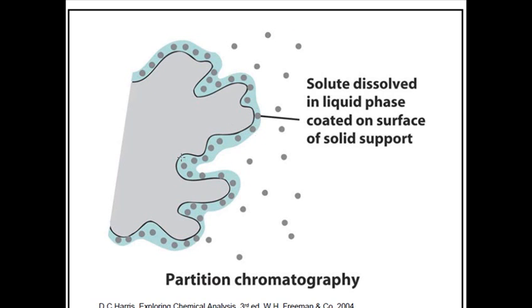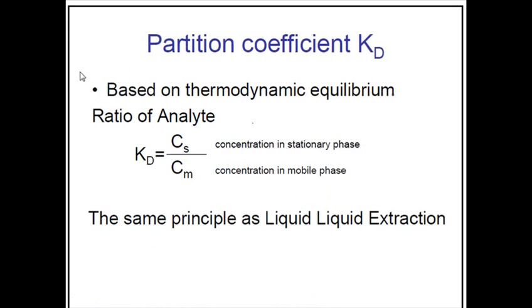In the second one, we are doing the partitioning chromatography. In this case, it is based on solubility. So what is this solubility? Here, some solutes dissolve in this coat which is around the stationary phase, and some dissolve less in this and more in the mobile phase. Some molecules which dissolve greater in this stationary phase coating will stay there, so they elute last, and some which do not dissolve in this coating of stationary phase elute faster. By making this partitioning using solubility, we can separate some molecules.